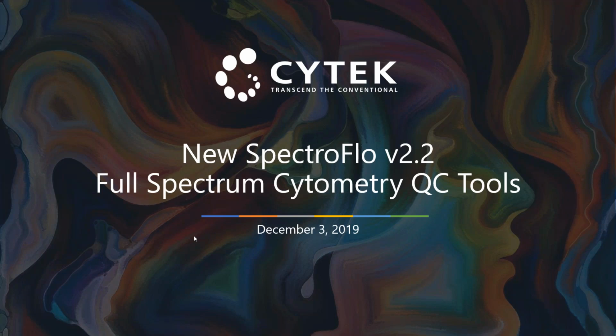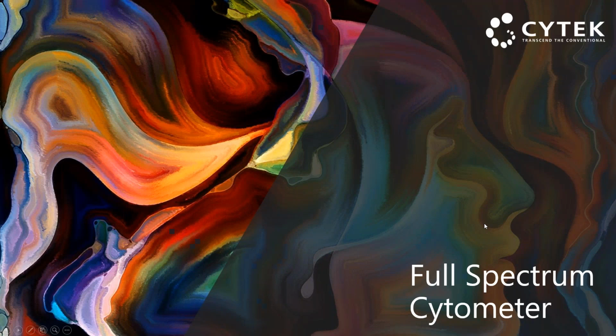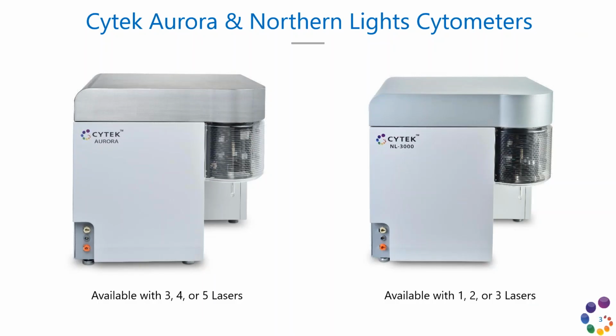All right. Before I jump into all of the great SpectroFlo version 2.2 tools, I'd like to step back and quickly highlight the platform that the data we'll go through today was collected on. That data was generated from a full spectrum cytometer from Cytek. There are two different product lines for these. There's the Cytek Aurora, which comes with 3, 4, or 5 lasers. And there's also the Northern Lights product line, which can be available with 1, 2, or 3 lasers.